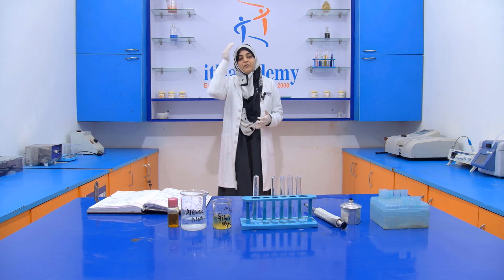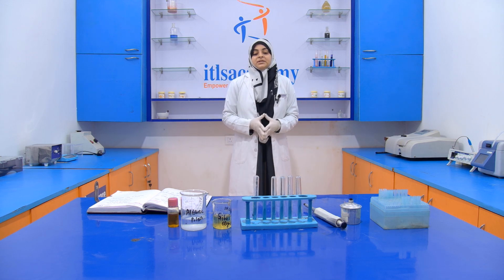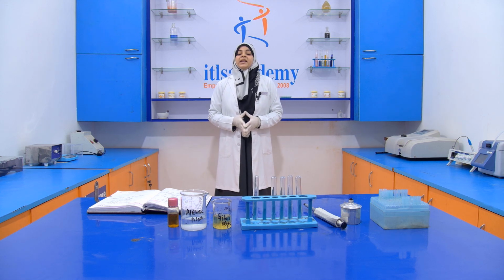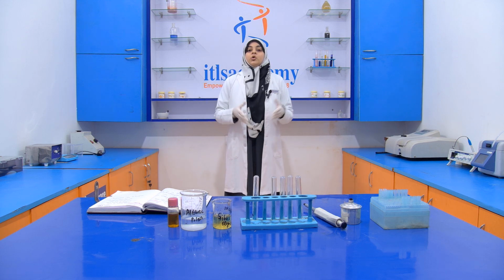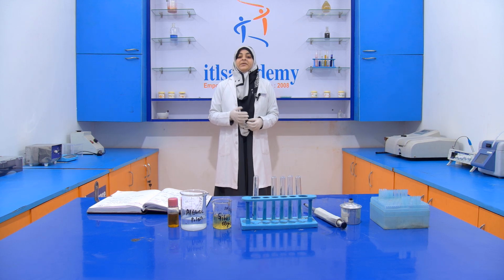Okay, so before starting this experiment we have to know what adulteration means. Simply, adulteration is defined as the addition of a chemical compound into a food product to increase its quantity, to increase its flavor, to enhance its color.